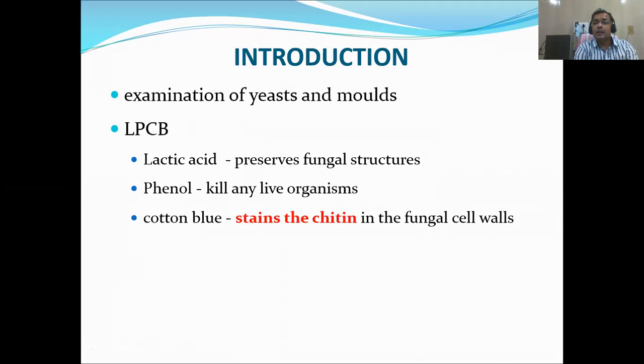So whenever you are handling fungal plates, you should follow proper biohazard and biocontainment procedures, and it is better to handle pathogenic fungi in a biosafety cabinet. Once you add phenol to your fungal sample, phenol will kill the organism, and it is then safe to handle outside the biosafety cabinet.